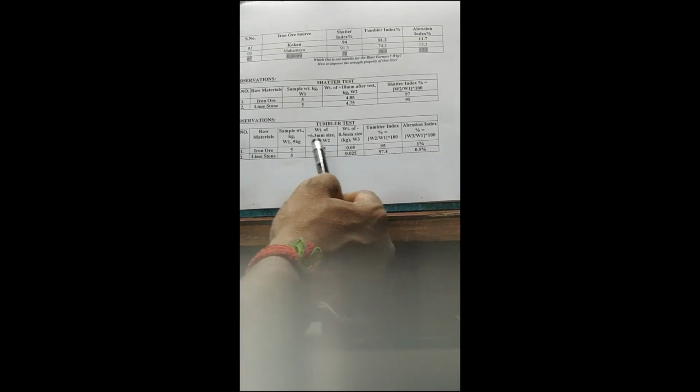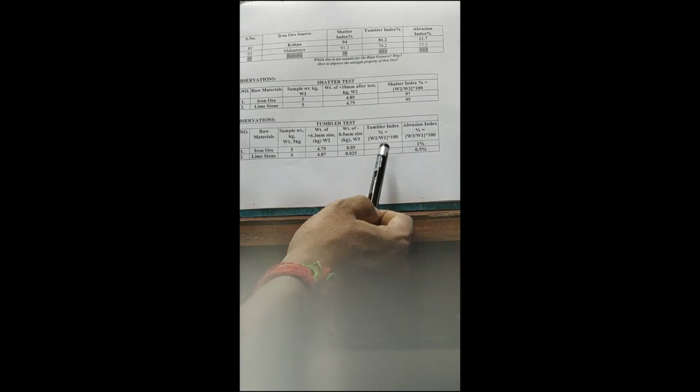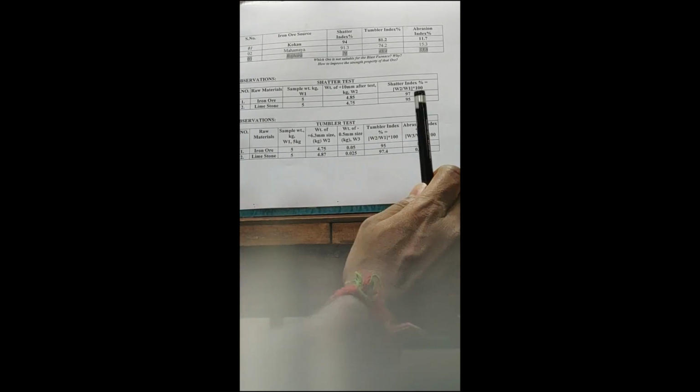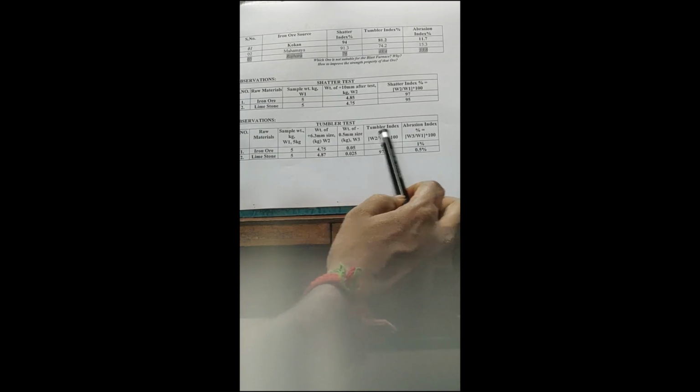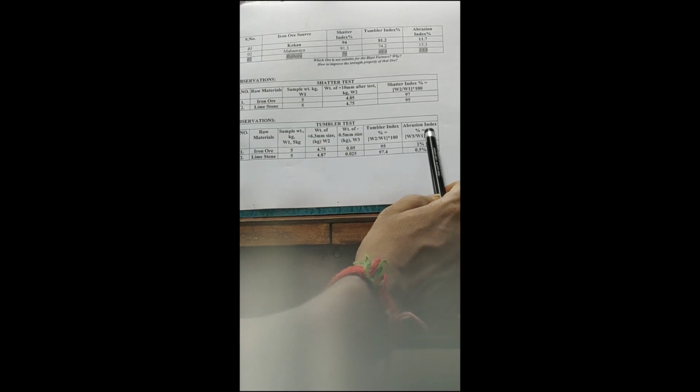So the tumbler index is W2 by W1 into 100. We got 95 for iron ore and 97.4 for limestone. And for the abrasion index, similarly, for the 0.5 screen we take W3 by W1 into 100. That is 1% for iron ore, and for limestone we got 0.5%.